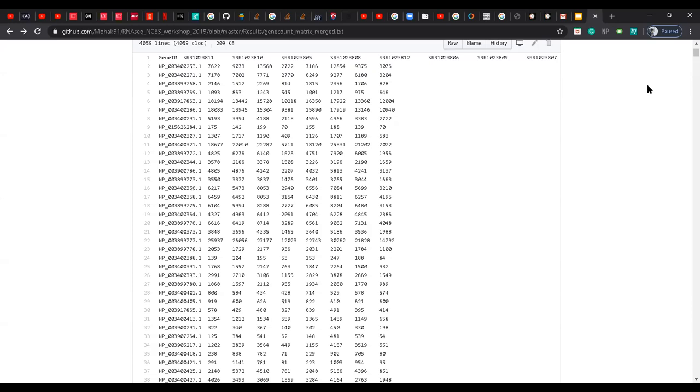And we first saw how our data looks, and then depending on if the quality is good or bad, we proceeded in that direction. The first thing that we did was FastQC, where we were checking how the quality of the reads was, and then we used this software called BWA. That uses the Burrows-Wheeler transform algorithm that we had discussed in the last theory class.